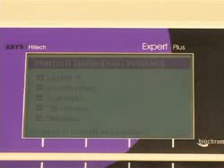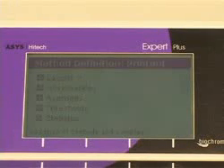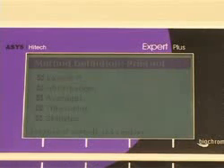The final page of the method set-up is defining what to print out. The method can then be saved for future use.